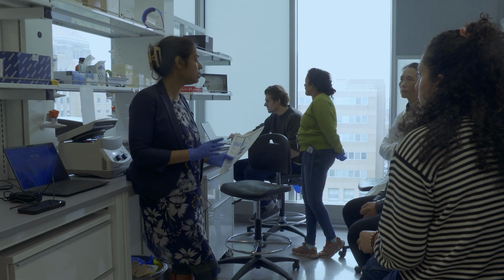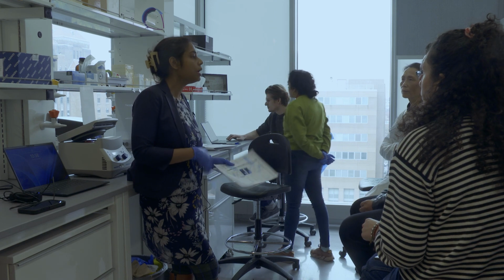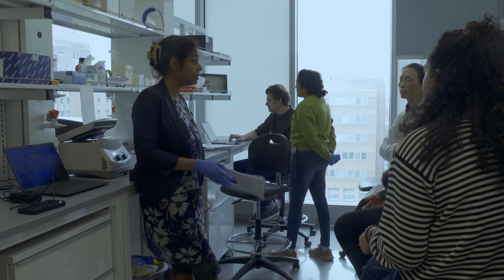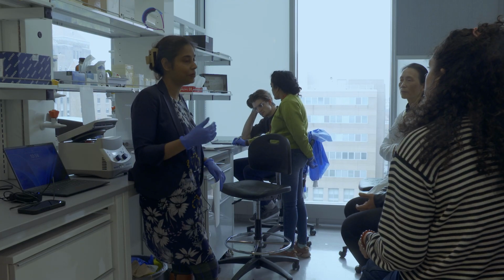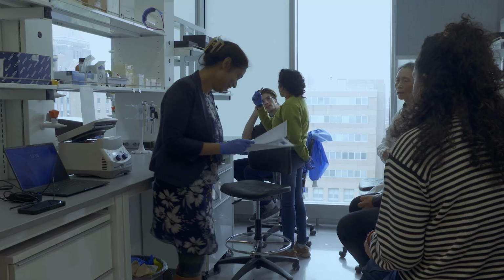Is this not a clinical lab, or is this a clinical lab? I don't know, in some labs I worked with, they have different specifications and protocols. So they just use it one time and then they toss it. But if you are part of a research lab, you can just use it.